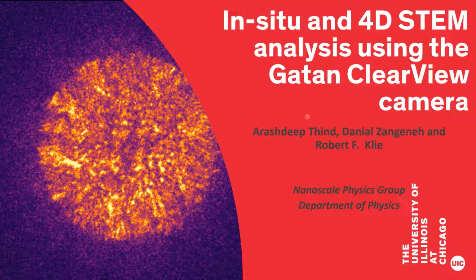This is our new webinar, In Situ and 4D STEM Analysis using the Gatan ClearView camera. My name is Fernando Castro. I'm an application scientist for Gatan. I'll be your host today, and I'm very excited to welcome a great group of speakers to present some of their exciting research they've been doing using the ClearView camera.